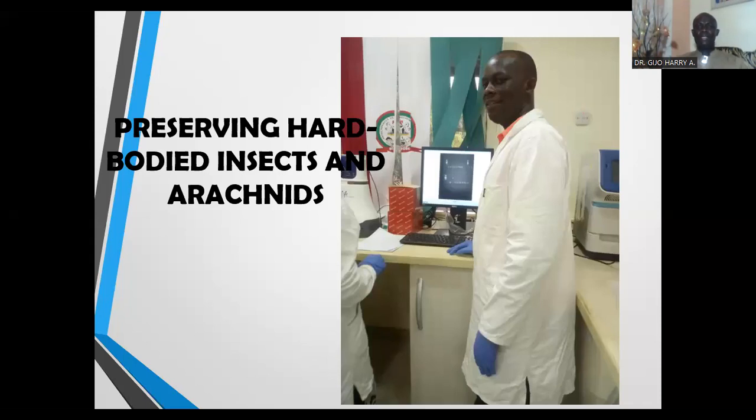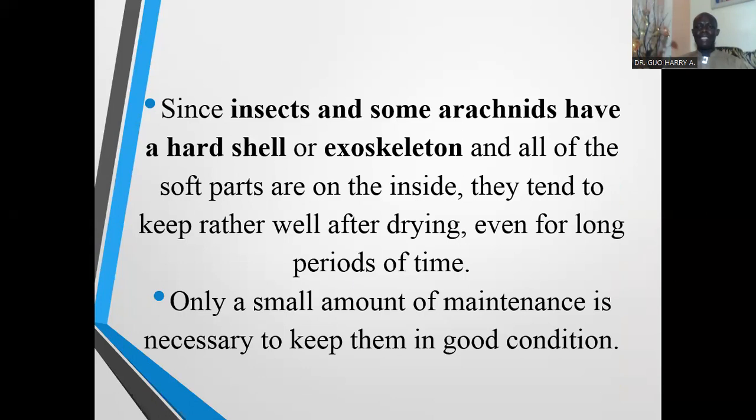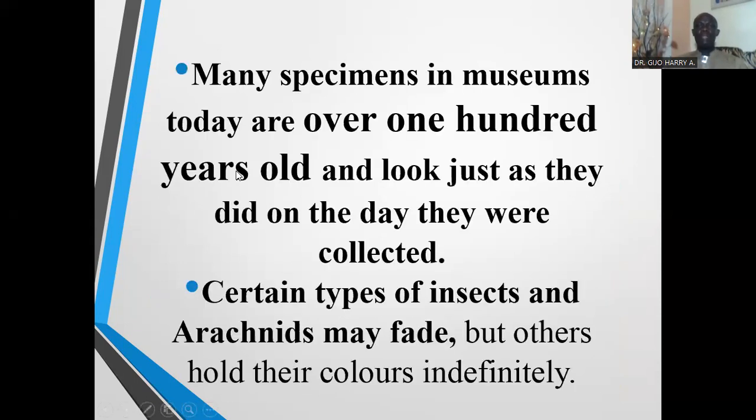Since insects and some arachnids have a hard shell or exoskeleton, and all of the soft parts are on the inside, they tend to keep rather well after drying, even for long periods of time. Only a small amount of maintenance is necessary to keep them in good condition. Many specimens in museums today are over 100 years old and look just as they did on the day they were collected. So because of the hard exoskeleton, the hard-bodied insects can be easily pinned and left for a long period of time, even for more than 100 years.